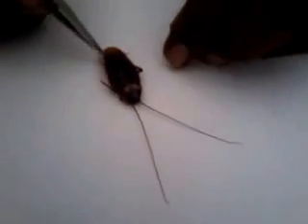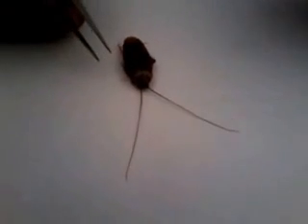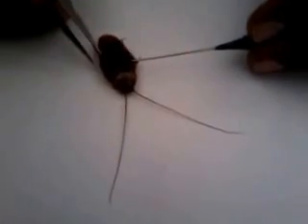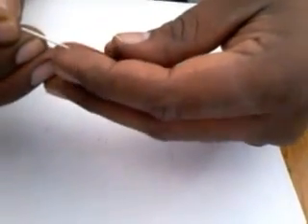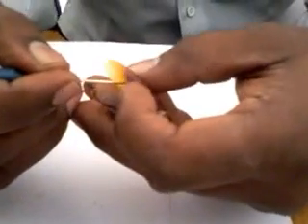The cockroach is an insect which has two pairs of wings. This is the first pair of wings — it is called the forewings. We have a pair of forewings, and I am dissecting this forewing and removing it from its body.